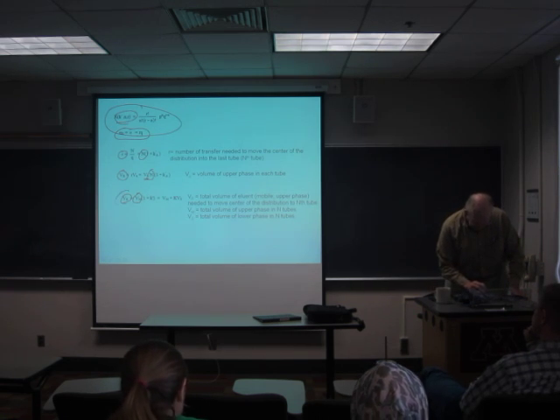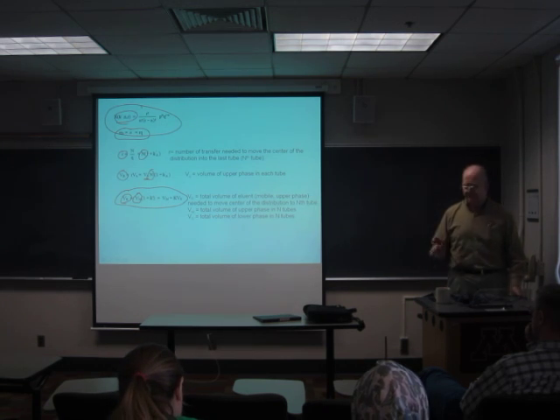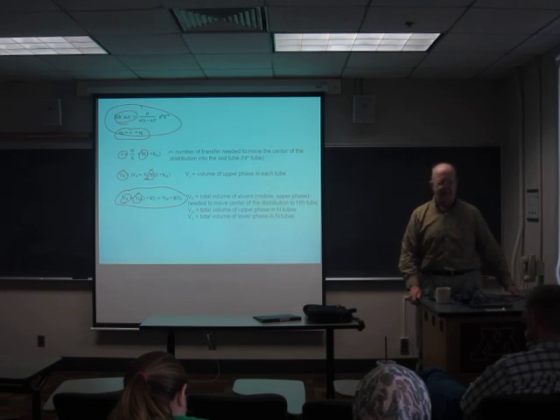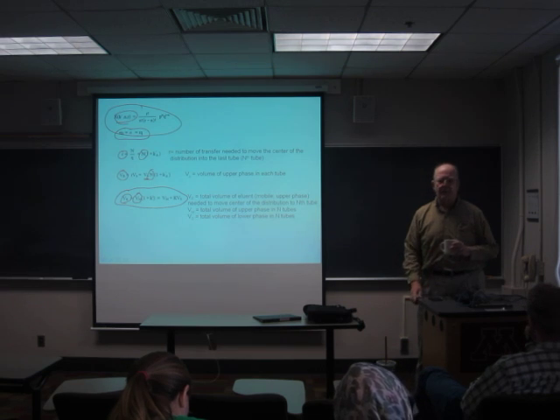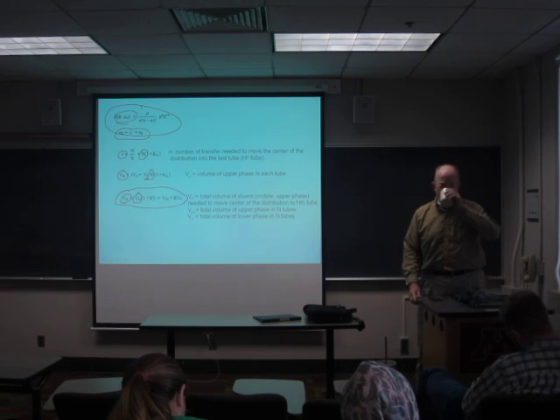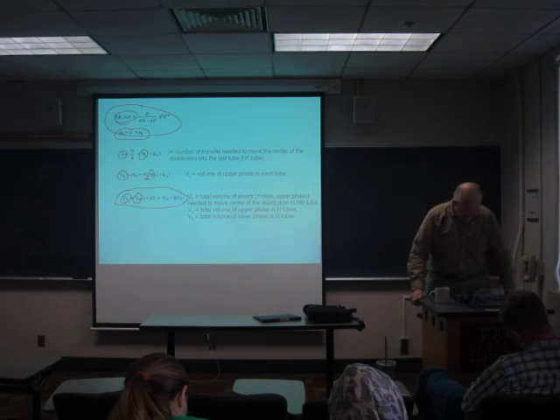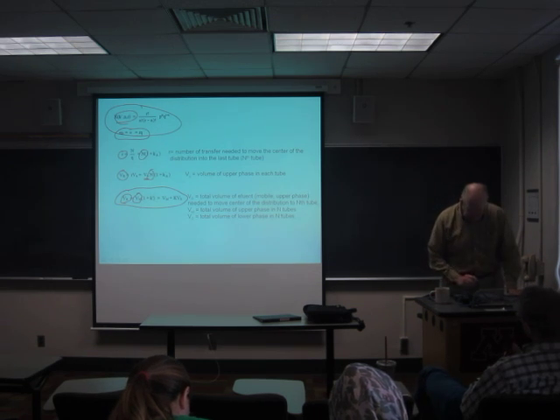This last equation is really an important equation. It tells us when we expect the stuff to come out of the column. At what volume of eluent will it come out of the column? This is called the retention equation. And it's really the most important prediction that the plate model makes.